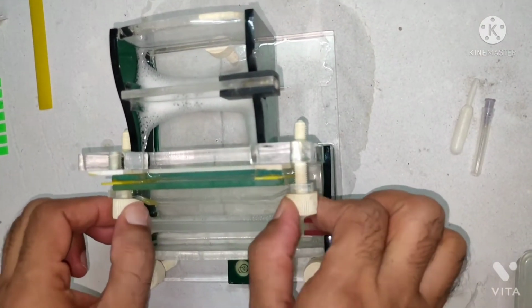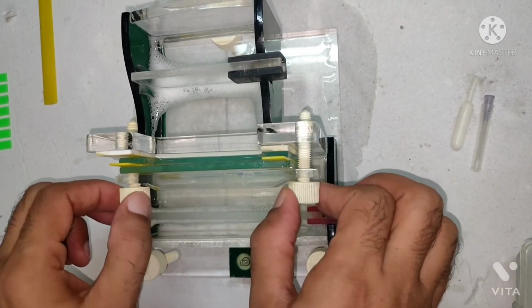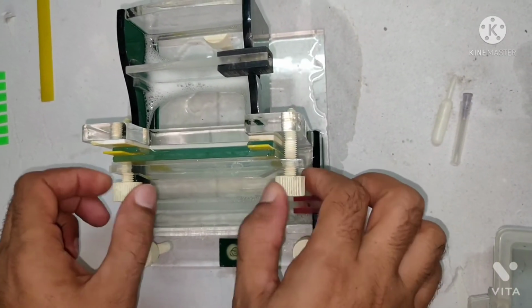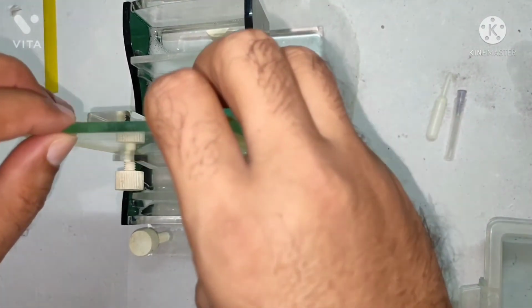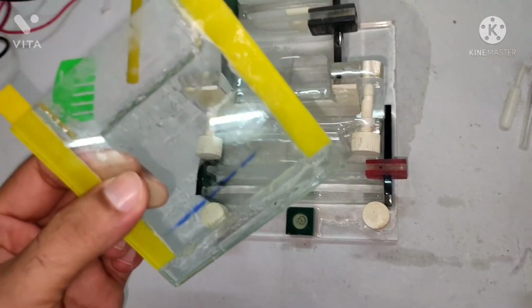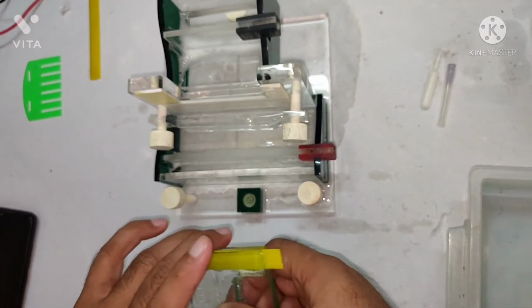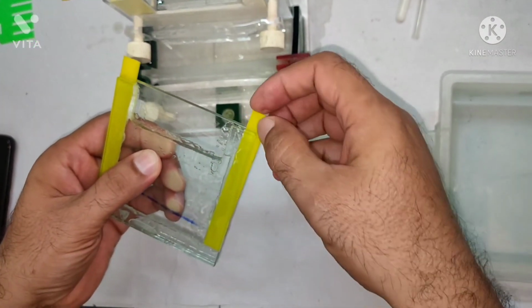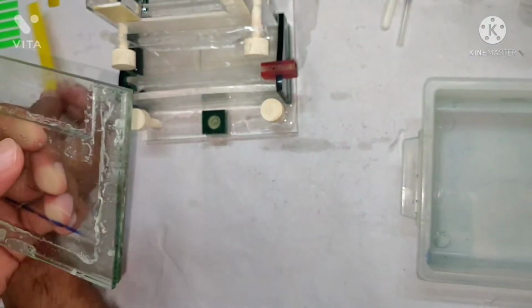the gel. Okay, so just you open like this, and see this opening, it depends upon the apparatus to apparatus. Okay, so here this facility is there. This is very small gel actually. This can be called as baby gel. Okay, so yeah, so now I removed. Okay, so now you can see the status of the tracking dye. Okay, and now I just remove the spacers very carefully so that it won't break the gel. Okay, so I removed one spacer.